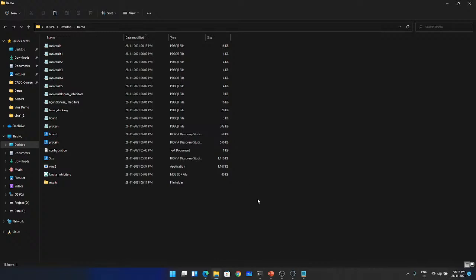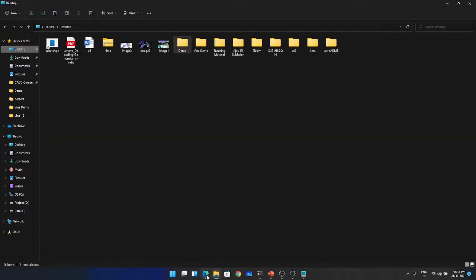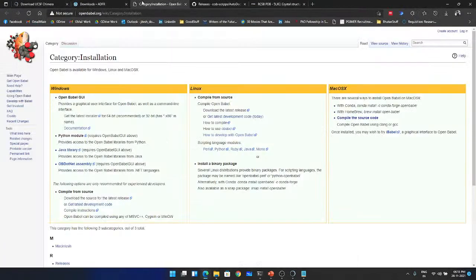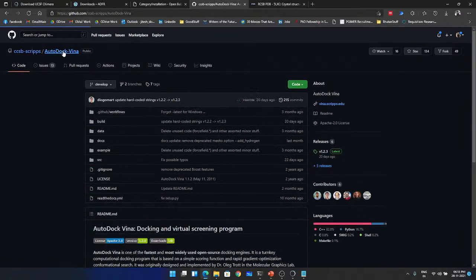Now that we are going forward to other types of docking, we need to introduce some other tools. So now we are going to use this tool that we downloaded and showed you earlier, the AutoDock Vina scripts. These scripts can be used to perform different flexible docking preparations, water preparations, and zinc preparations. So all the scripts are there in this. Either you can download this entire folder and use some of those things.